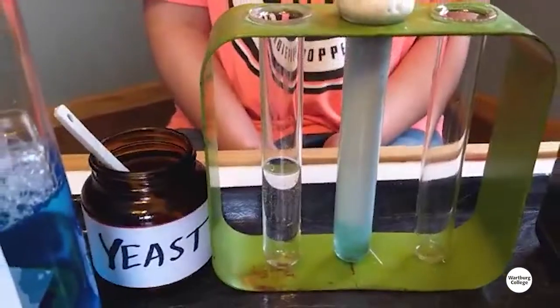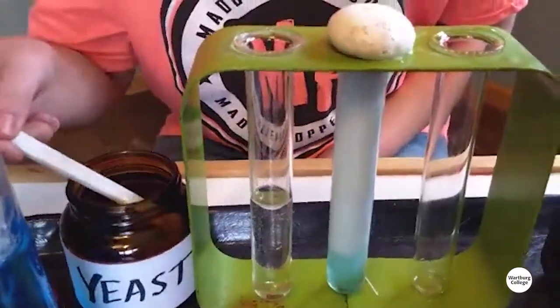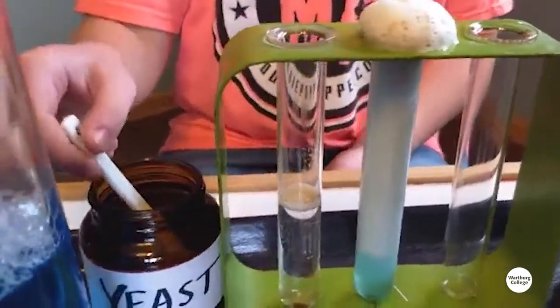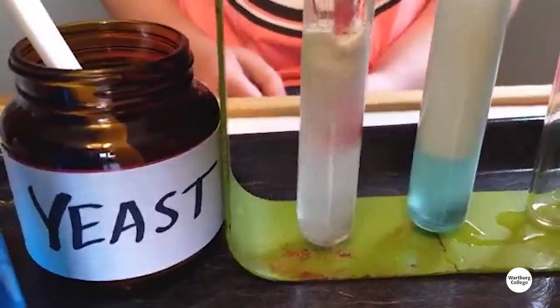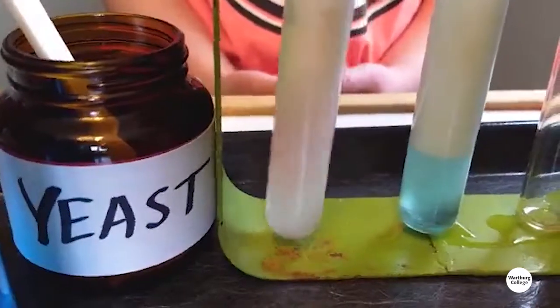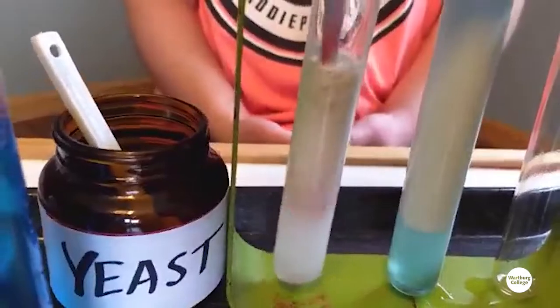Should we add a little bit of yeast to that first test tube? You can just stir it in there. So you can see it still works. It's the yeast and the peroxide that gives you that bubbly reaction. All the soap does is give you a way to collect those bubbles so they don't just burst.